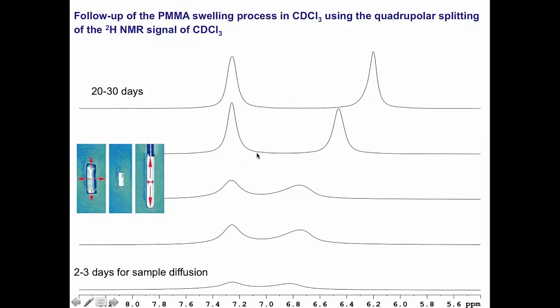And then you have two options here. If you know that your sample is stable, you can swell the gel with the solution containing your sample. But if not, because it will be 20 days inside, you can swell the gel, measure the quadrupolar coupling, and the other thing that you don't know is what is going to be the performance of the gel once you swell it.